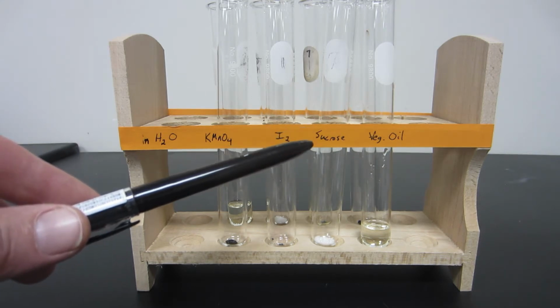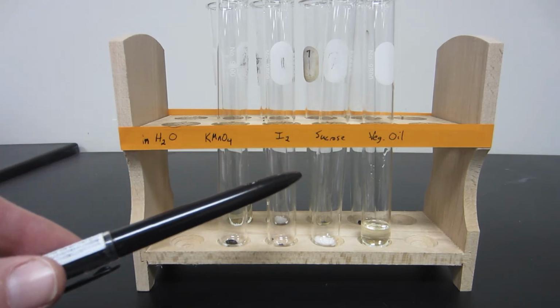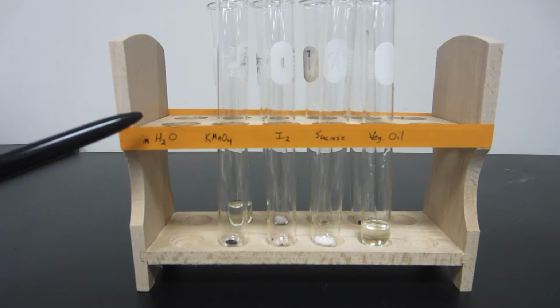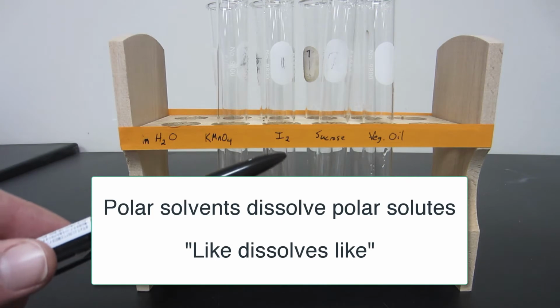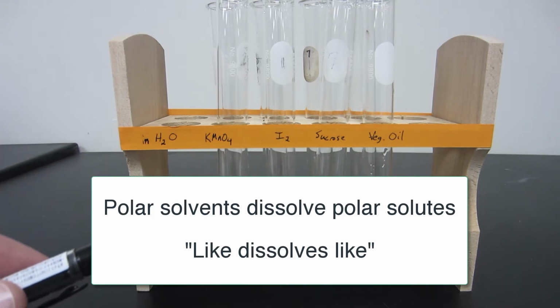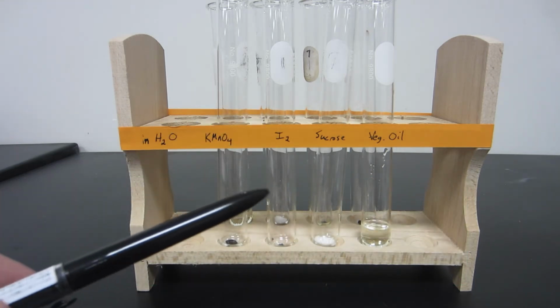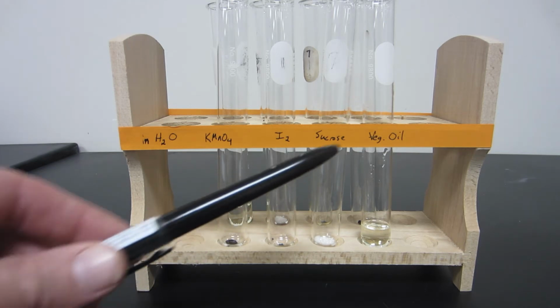Okay, so it has some oxygens in there, and as of right now for our class, we know that those are going to be polar molecular compounds. So just to anticipate what is going to happen here, since water is a polar solvent, this polar molecular compound should dissolve in it. Sucrose, the more common name for it is table sugar. We know, just from general experience, that table sugar dissolves in water. So that's one thing we can anticipate.